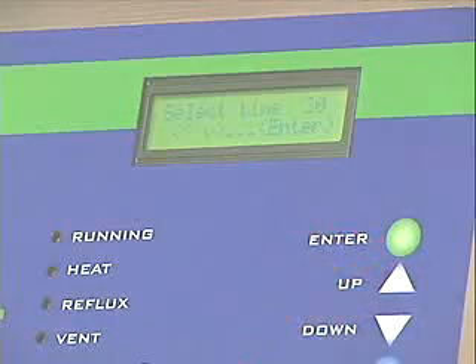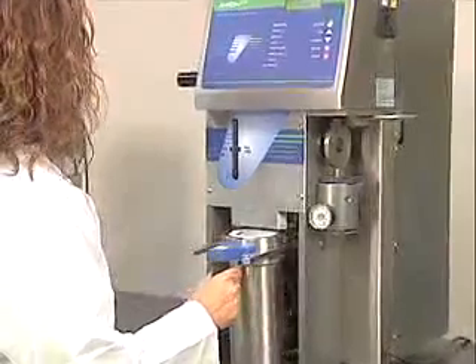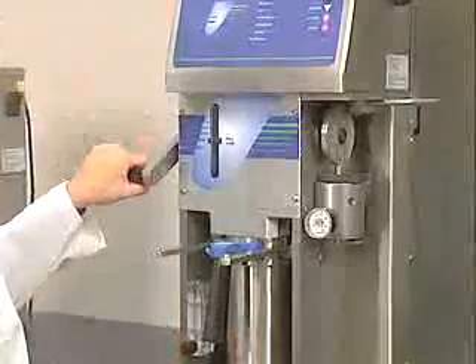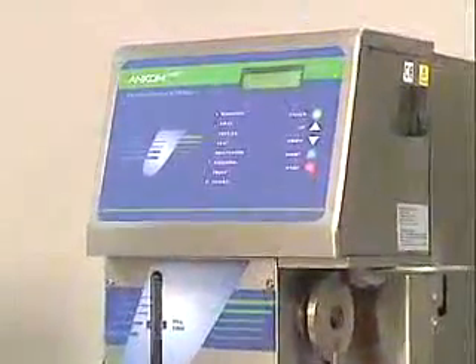Simple, easy-to-read instructions on the screen of the XT15's control screen guide the technician through each step. Once the program is set and the extraction chamber closed, the technician just pushes the start button and the process begins.